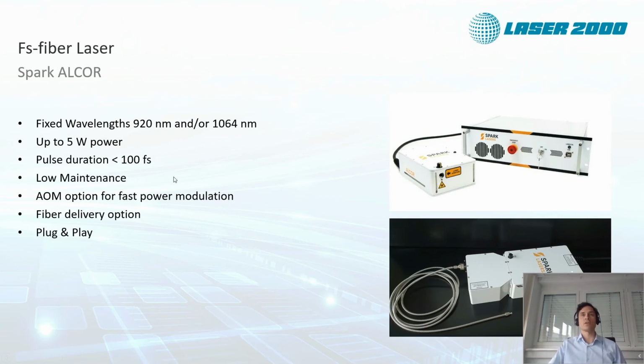And what they also have, they have an integrated AOM in the laser head. So this is the new version where it's integrated here in the front. Below is the old version where it was in front of the laser head. And with this AOM option, you don't need a pockel cell for your beam path in the multiphoton microscope setup.